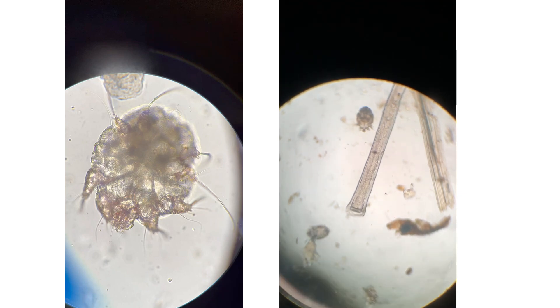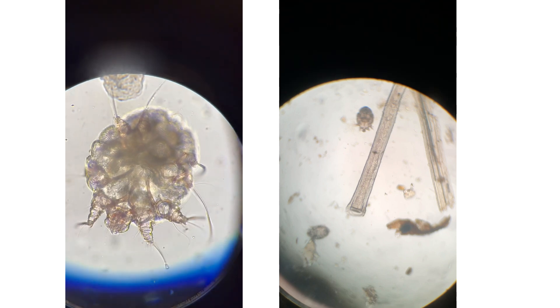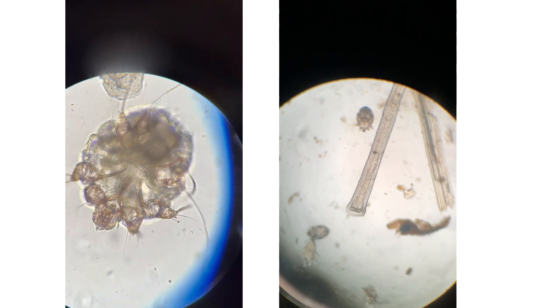In the second clip there are two mites at 100 times magnification, showing how slowly they move. They do not hop. They do not fly. They crawl.